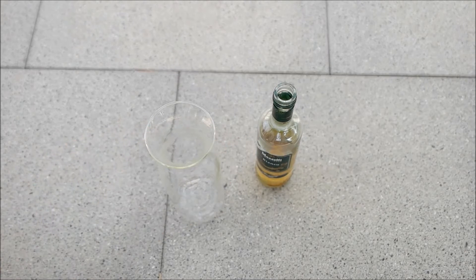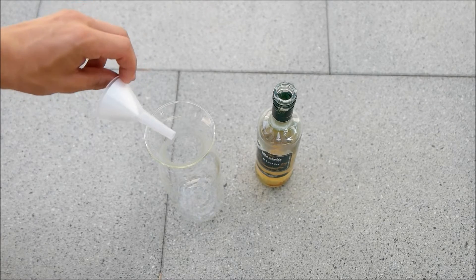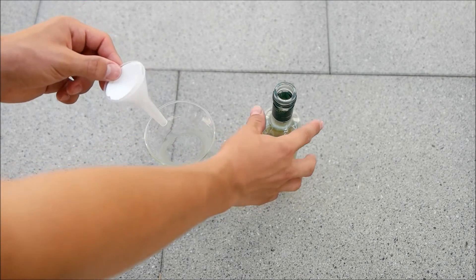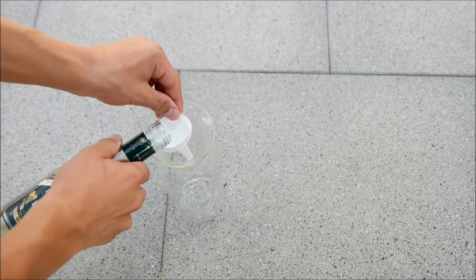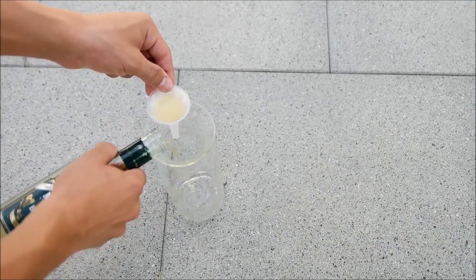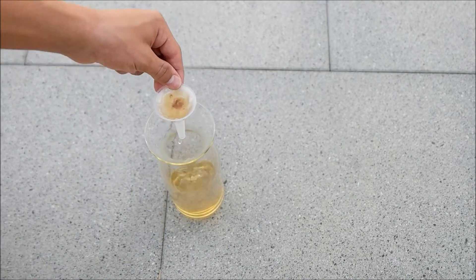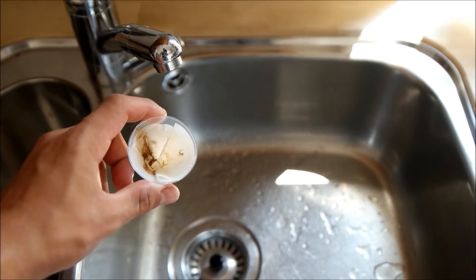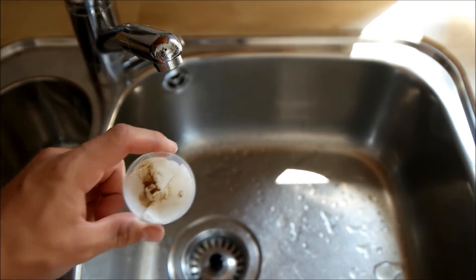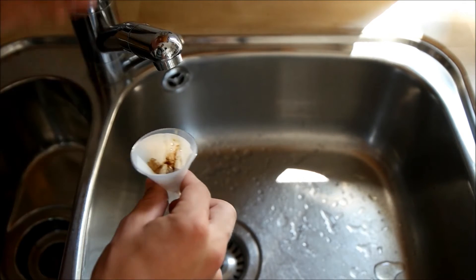Now let's start with the acetic acid or vinegar method. I just took a funnel with a filtering paper and put the vinegar through this.